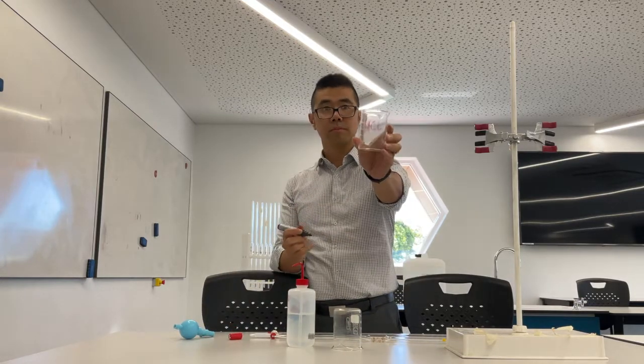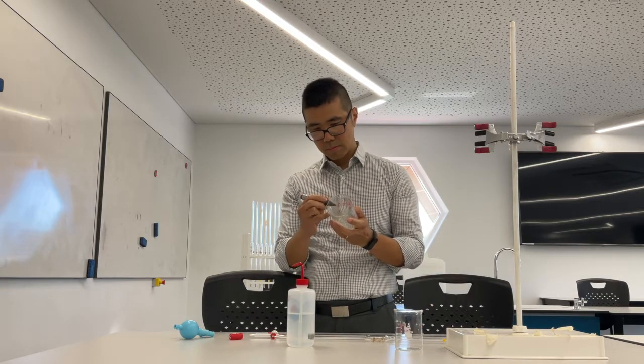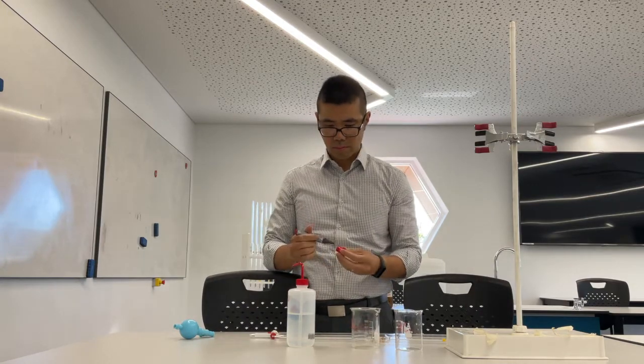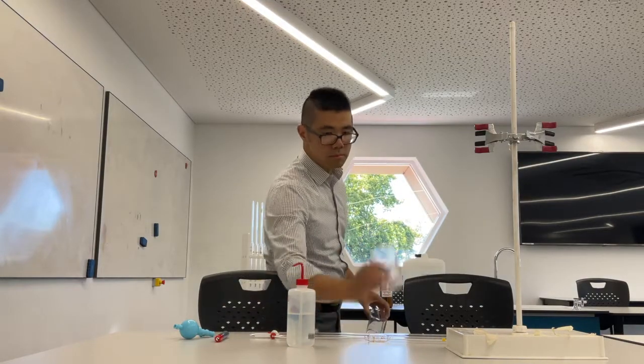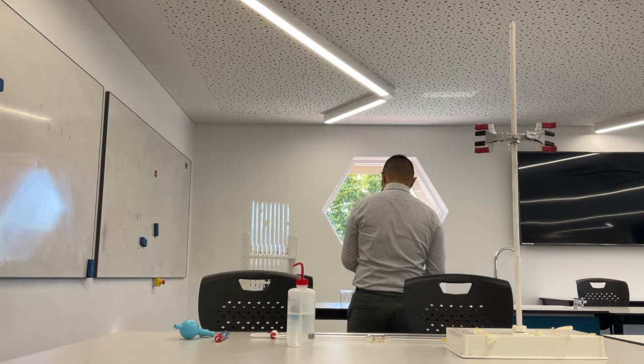What I'm doing now is marking out the beakers with what they're going to hold. One of them is going to be HCL, the other one is going to be NaOH. This is useful because they look exactly the same, so it's important to have that marked out. I'm making sure they're nice and dry so that they don't affect the concentration.